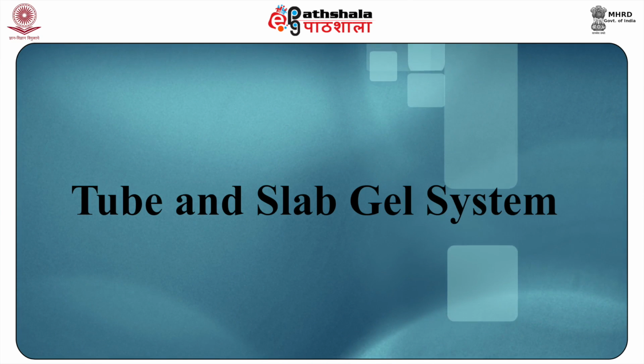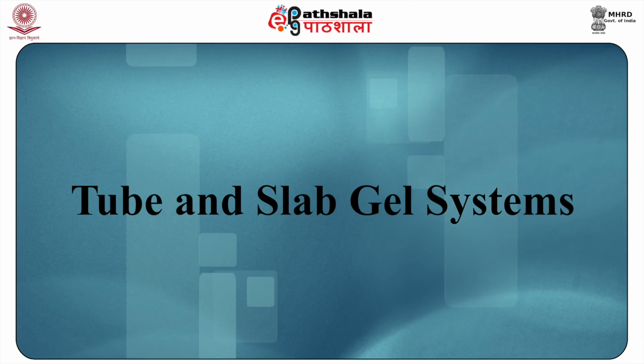If the arrangement of electrodes is in such a way that the upper bath is cathode, which is negatively charged, while the lower bath is anode, which is positively charged, and anions are allowed to flow towards the anode, then this type is called an anionic system. When the flow is in reverse direction, that is cations flowing towards the cathode, which is the negatively charged electrode, it is called a cationic system. Next, we will be studying about tube and slab gel systems.